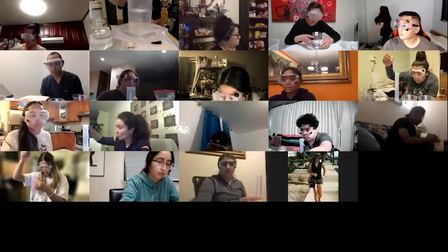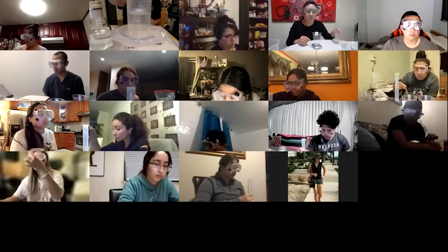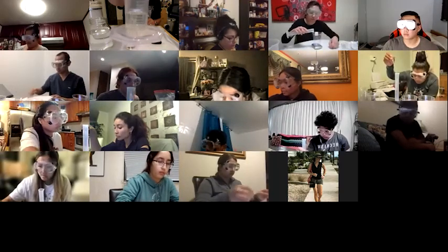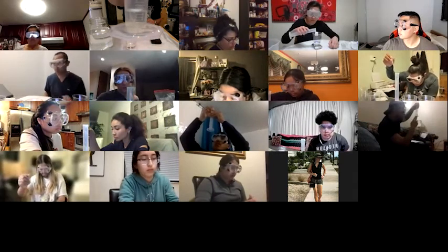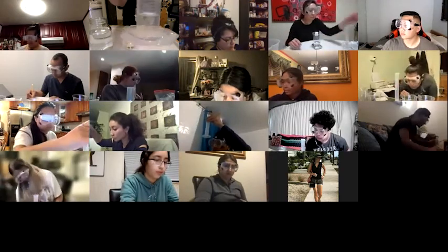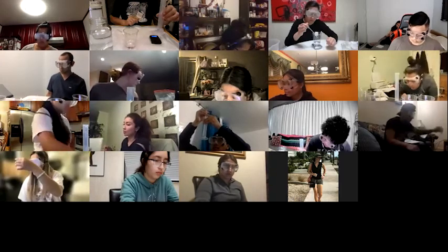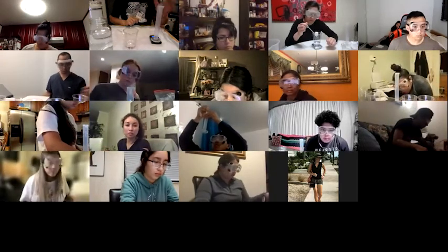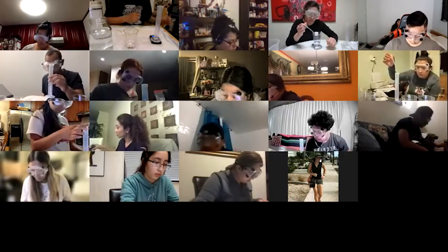So I would call that 5.0, right? I really can't make it any more. I can't get any more significant digits than that. I can't say 5.00 because there aren't sufficient markings on this to let me tell the difference between 5.0 and 5.1. So 5.0 is as good as it gets for me. And then I just transfer it back to the balance and I just read the mass. Okay.